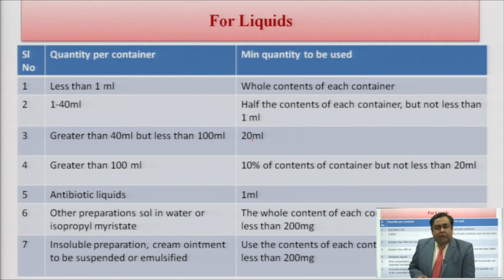Now, if the preparation which you are testing is an antibiotic in liquid form, the minimum quantity to be used is 1 ml of the solution. There are also many preparations which are non-antibiotic in nature.